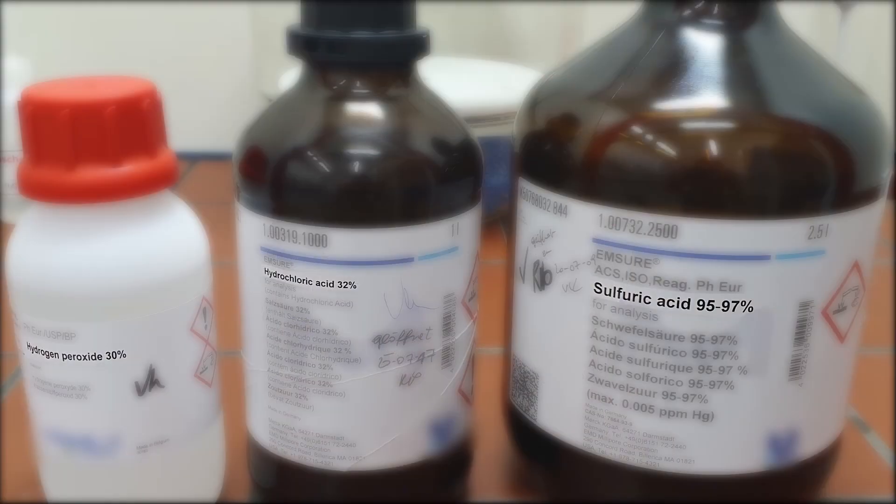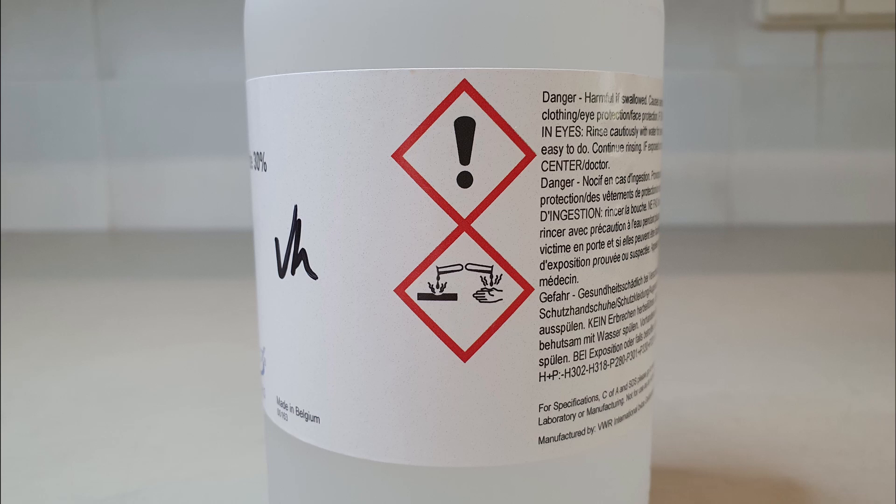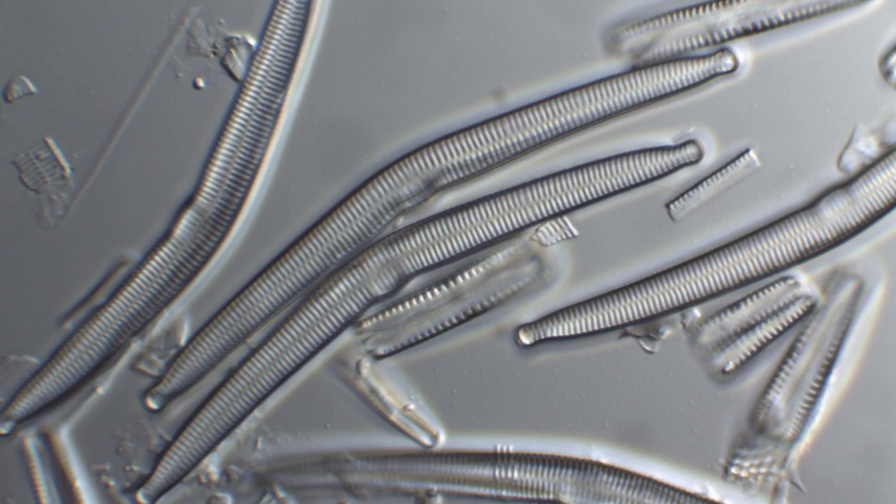The European standard mentions several oxidizing agents that can be used for the removal of organic content. In this video, we are going to demonstrate the hot hydrogen peroxide method, which involves less health and safety risks and is also gentler to the diatom frustules.